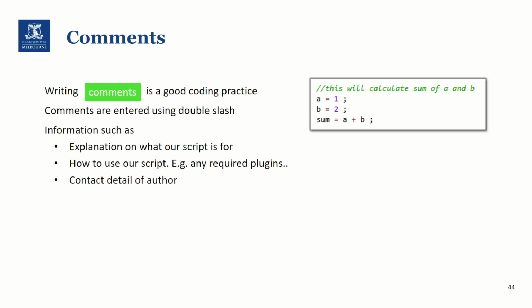Another useful information we can add for other people is on how to use this script. For example, which software or which plugins are required, and also the contact details of us as an author, so anyone who receives the code can ask questions and use it properly.